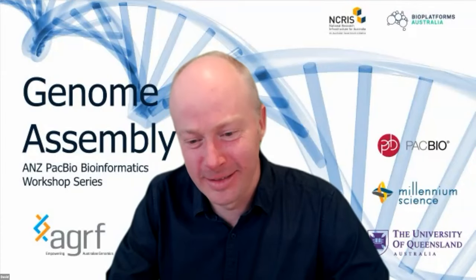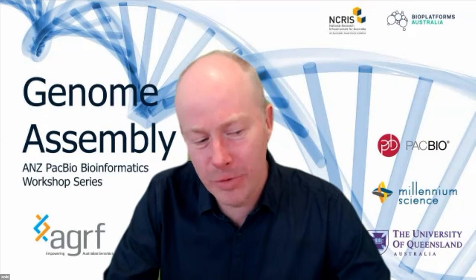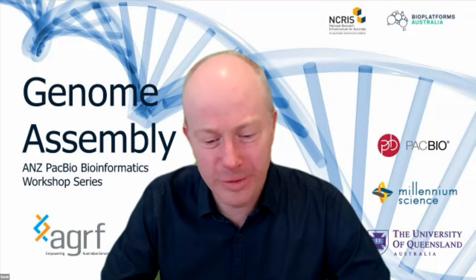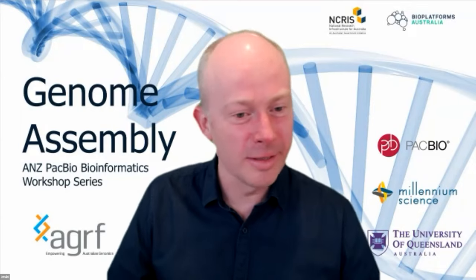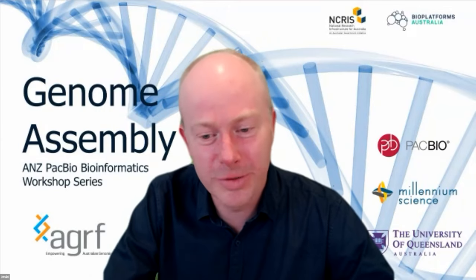IPA, you generally have to set up yourself. We do it on Pawsey, but you're up at UQ, so you probably do it at QCIF. Or David was saying today, they are going to be doing IPA through AGRF. So there's quite a few options there for you. Another option, if you just wanted to run HiFiasm at a command line, I've come across a post from Heng Li's lab. They have a tutorial of how to use that from just a direct command line. There's a lot of resources out there.